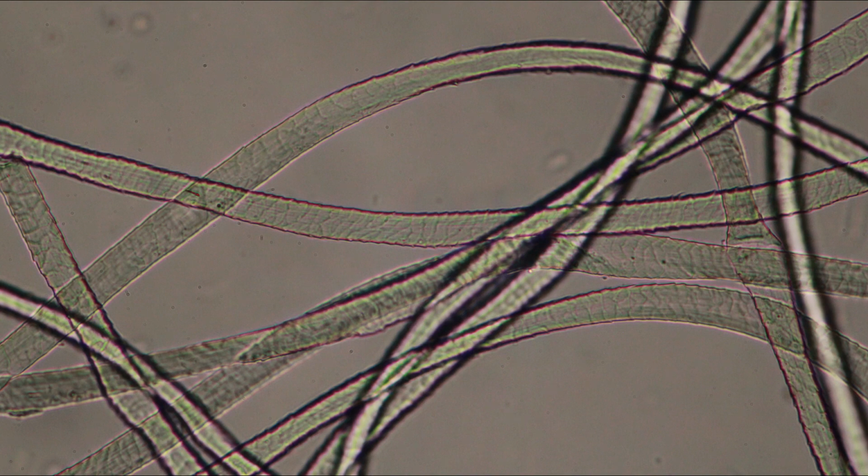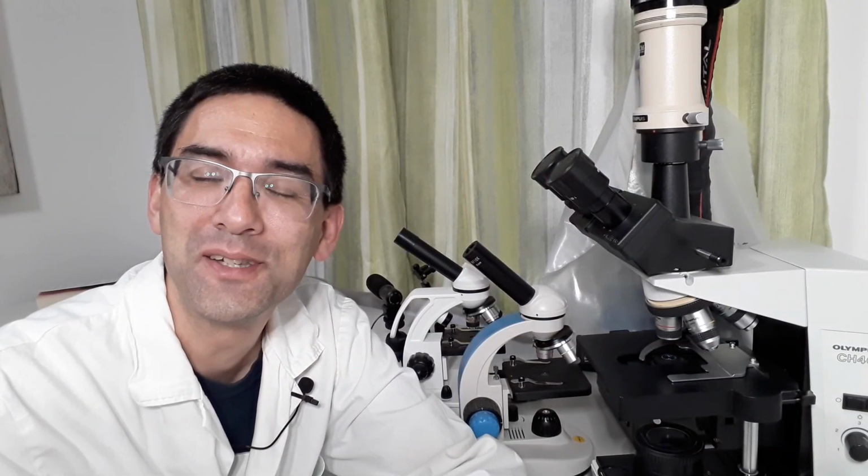However, it is also important to say that these diffraction patterns sometimes can actually be a big advantage to make small, difficult things visible. So for example, when you look at bacteria, they are very transparent, and when you close the condenser a lot, because of the diffraction patterns that are formed, you can actually start to see the difficult bacteria much better. Okay, so that's it.